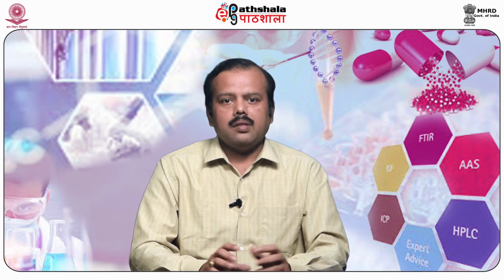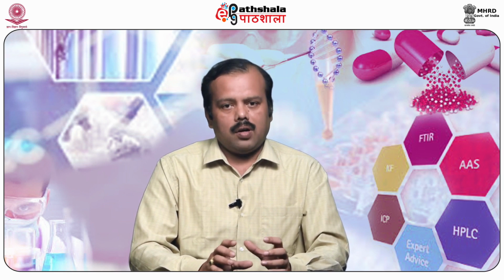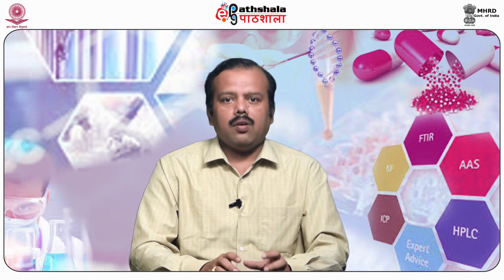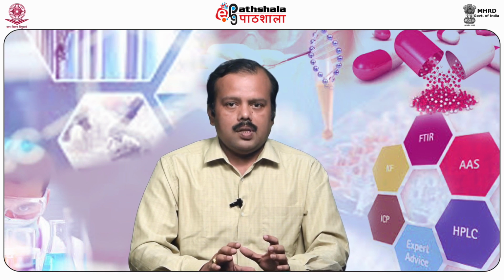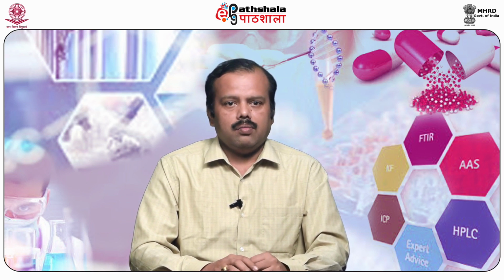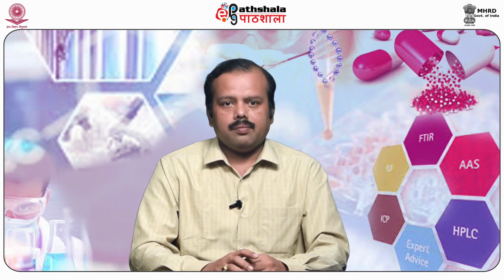After 15 minutes, the UV lamp is switched off and the white light is on, and simultaneously the airflow is also on. The surface of the laminar flow unit is again cleaned using 70% ethanol. After the ethanol dries from the surface, the spirit lamp is lit inside the laminar flow. Next, the hands of the worker are cleaned with ethanol. Now, we can start the aseptic work in the laminar flow unit.